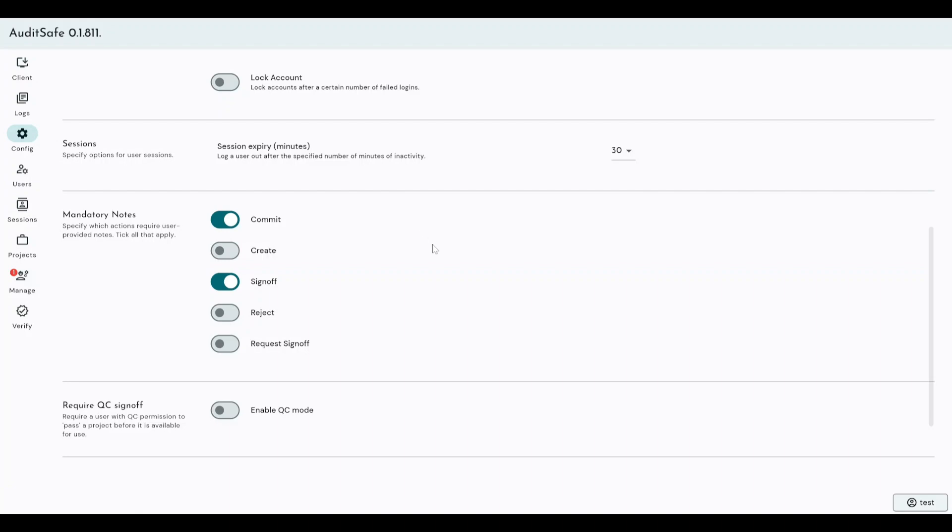So this is again just another security measure to make sure that say a user walks away from their computer and they're still logged in, there is the potential that another analyst could come along and start doing work and it would be attributed to the first user that was logged in, thus corrupting the audit trail for that particular project. So the ability to have an auto logout goes some way to minimize that risk.